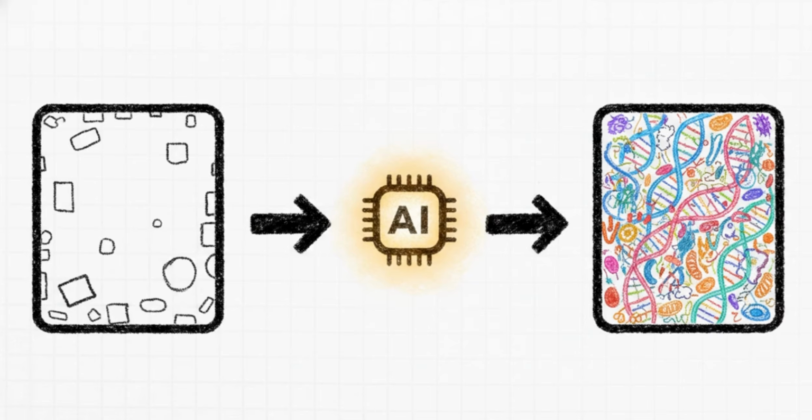The goal is to eventually take a simple, low-cost histology slide, feed it into the AI, and have the model accurately predict the rich, underlying spatial transcriptomic and proteomic profiles. We're literally using AI to turn the satellite view into a street view entirely computationally.